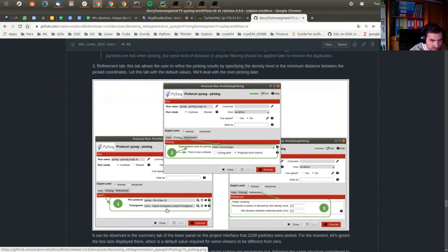And yeah, Dimitri, as you can see here, the imported ones, the original data. The less mathematically adulterated product, the better. And finally, we can refine all the. Okay, this is okay. One second.